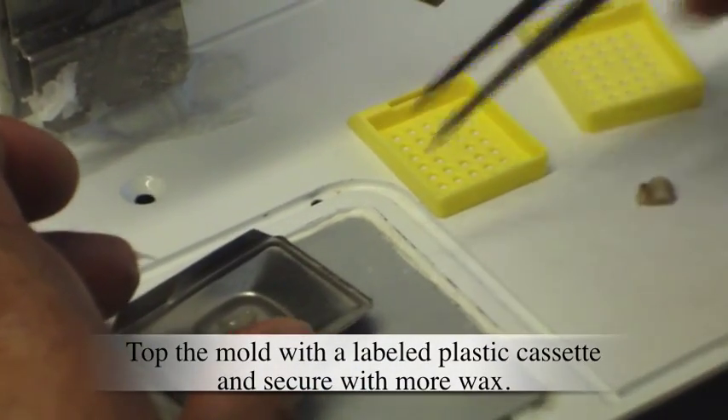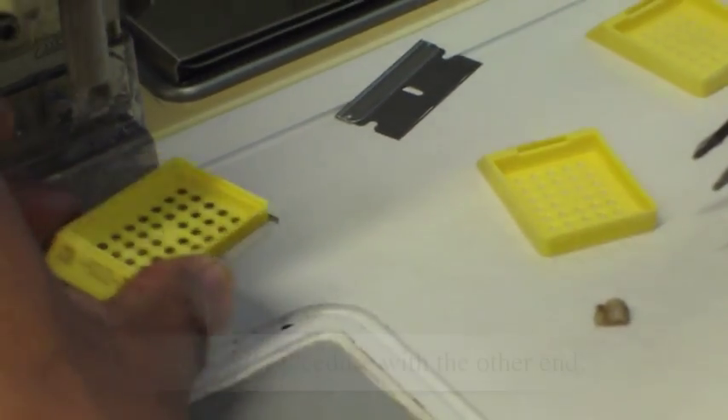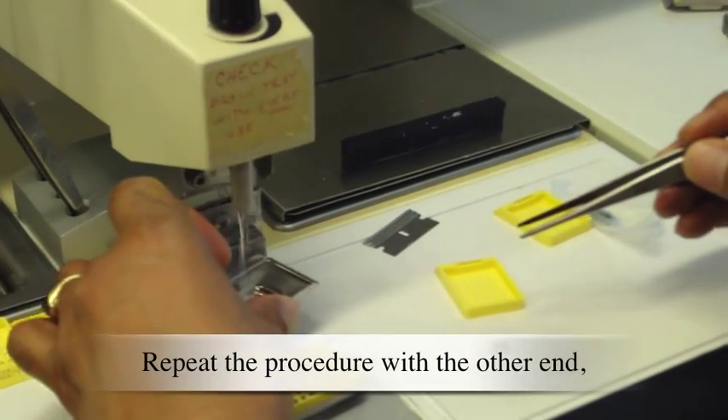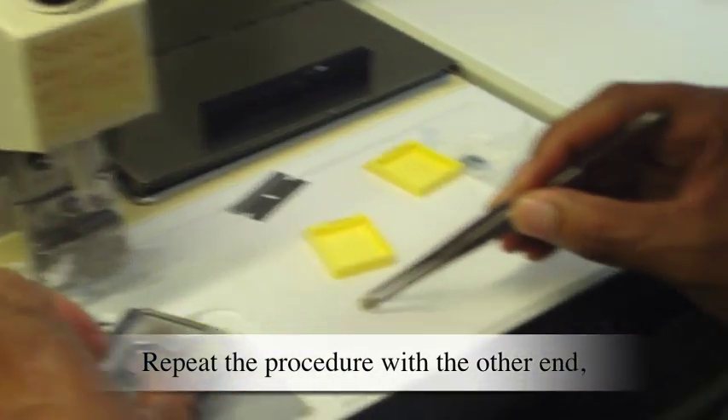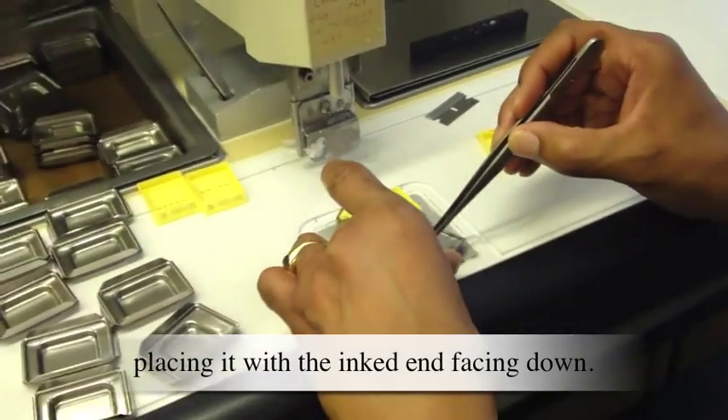Top the mold with a labeled plastic cassette and secure with more wax. Repeat the procedure with the other end, placing it with the inked end facing down.